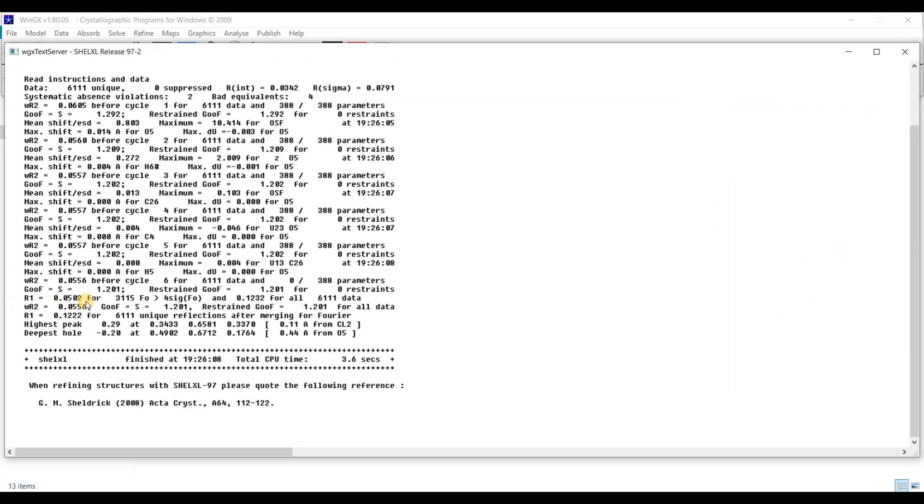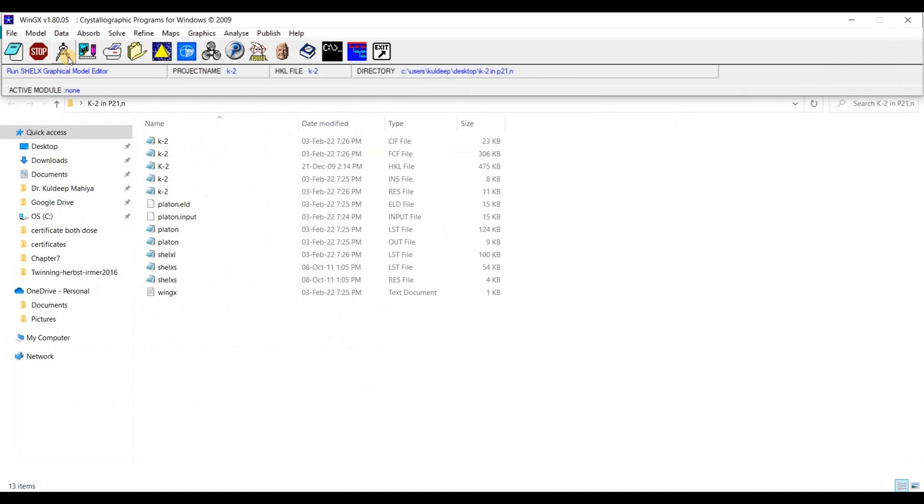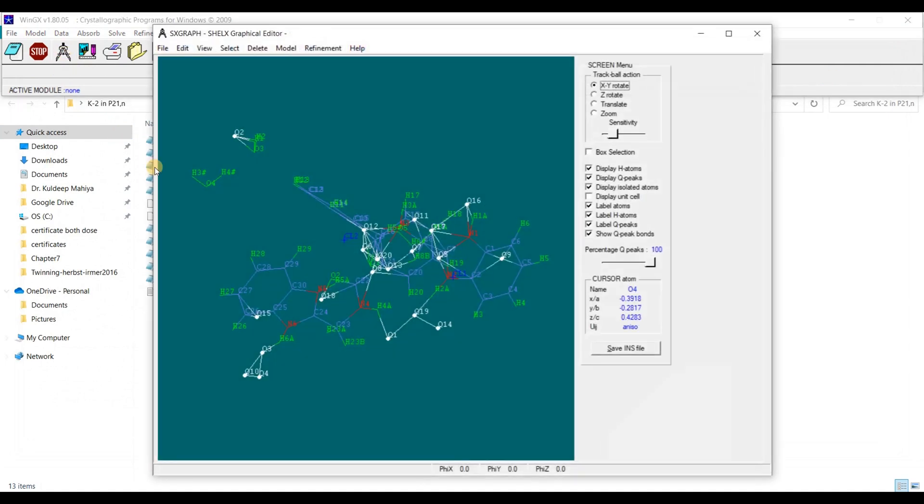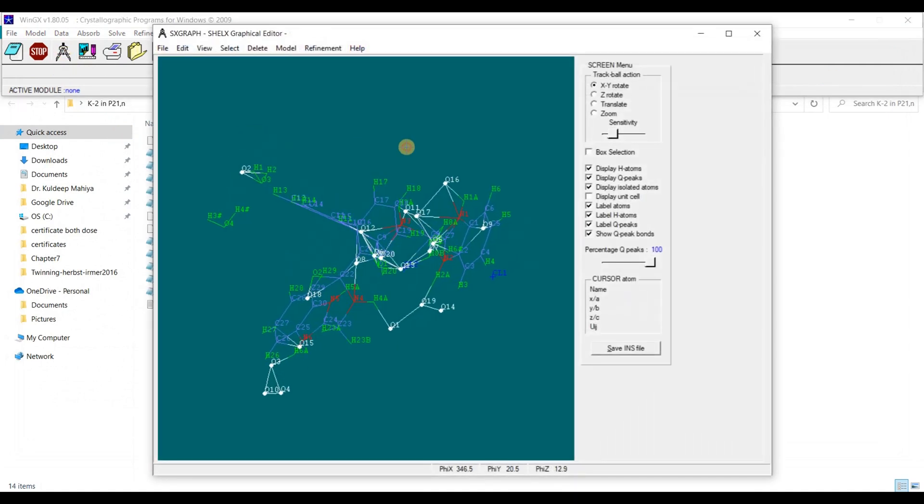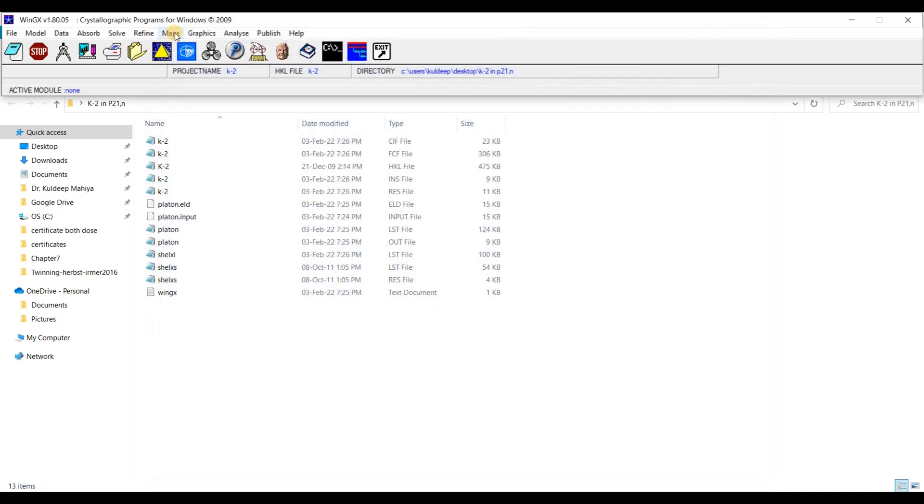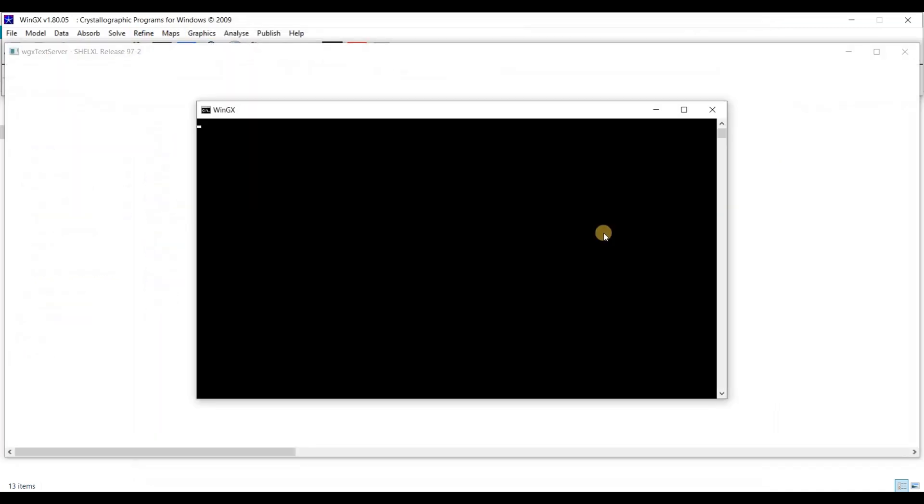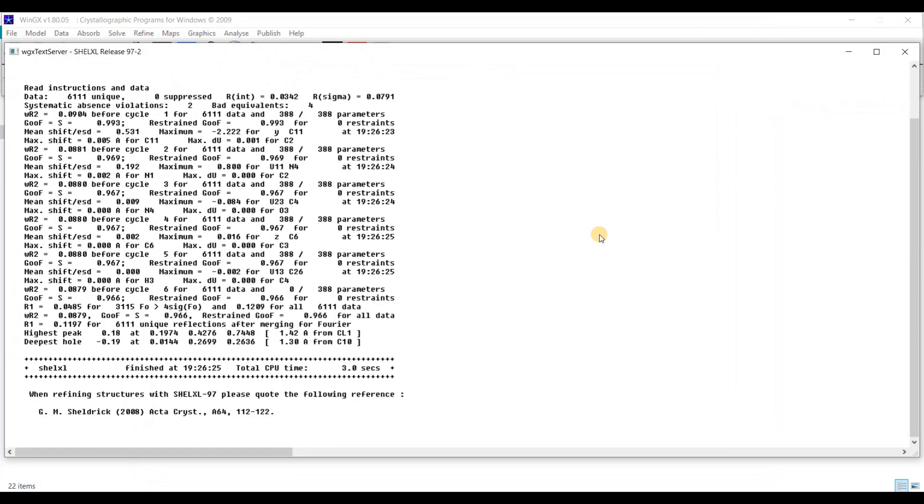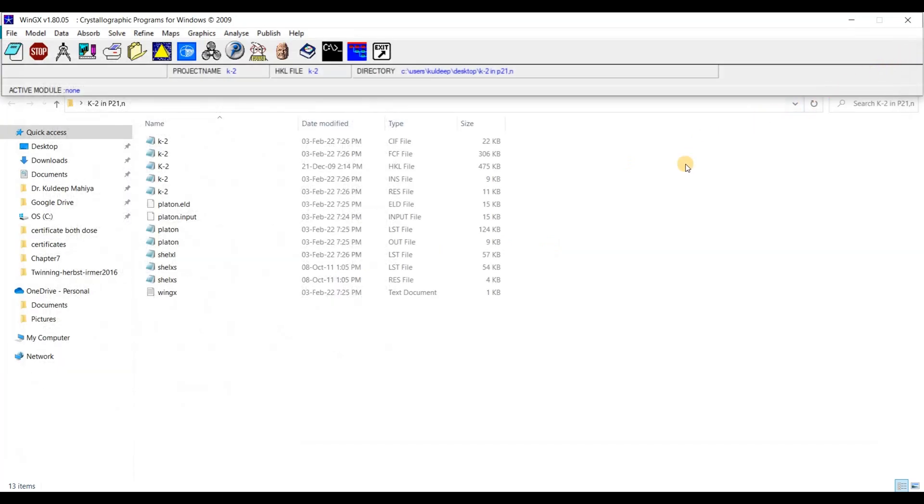Okay. So R factor is around 5.02. Let's see. Okay, save INS file. I am going to refine it once again. R factor around 4.85.